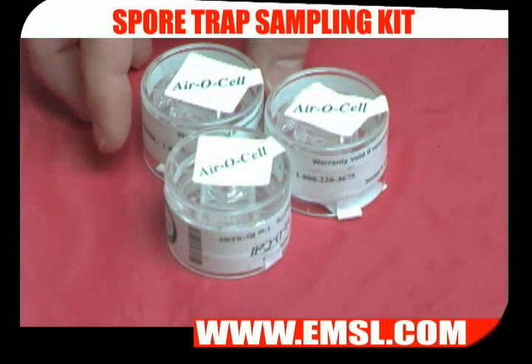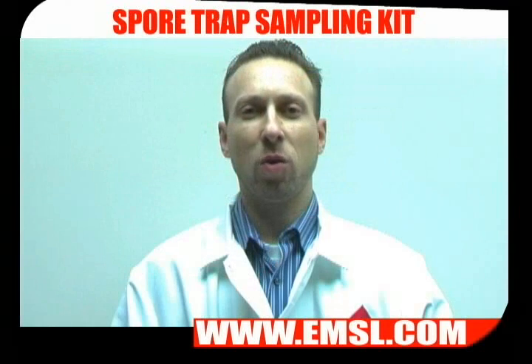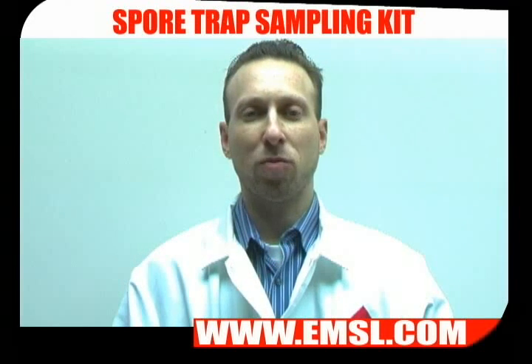For this demonstration I'm going to be showing you how to take a sample using the aerosol cassette. Make sure you're doing all your sampling with a calibrated pump or rotometer.